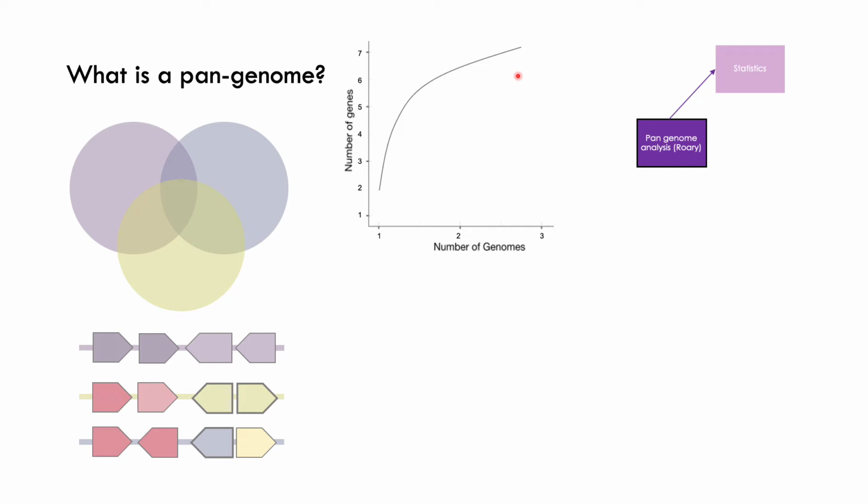You could have an accessory gene accumulation curve, or pick any kind of subset, but it's mostly done with a pangenome. And what this is really trying to indicate is the diversity and richness of our data sets, and how representative this is of that species or strain or whatever, and how well sampled or sequenced it has been.